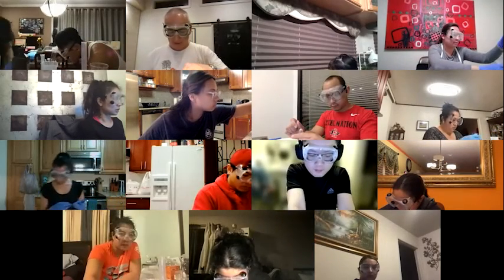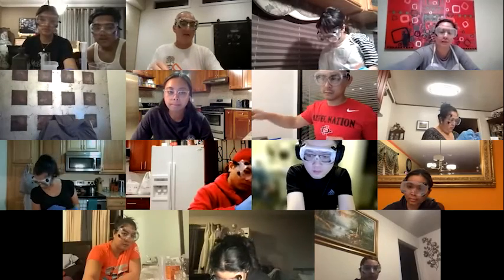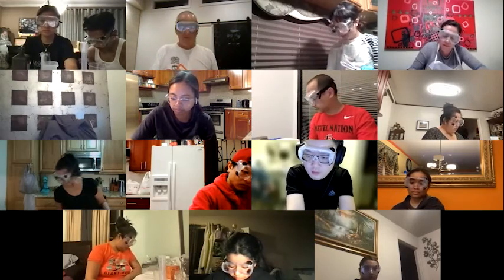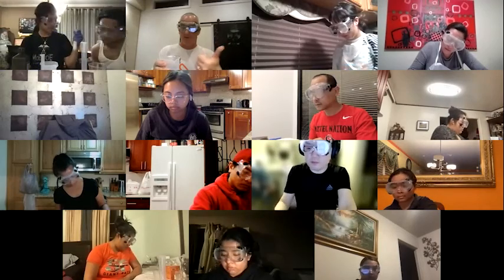If you have the concentrated HCl, it generally will fill all the way up, but this one's only partial. It's gonna be kind of tricky because you have to let the water out. I don't want all the gas to escape, so I'll keep it right side up. It might pop even better because we'll have hydrogen and also oxygen in there. We've done the first part of the reaction. We've seen gas production, and we've seen it displace the water.